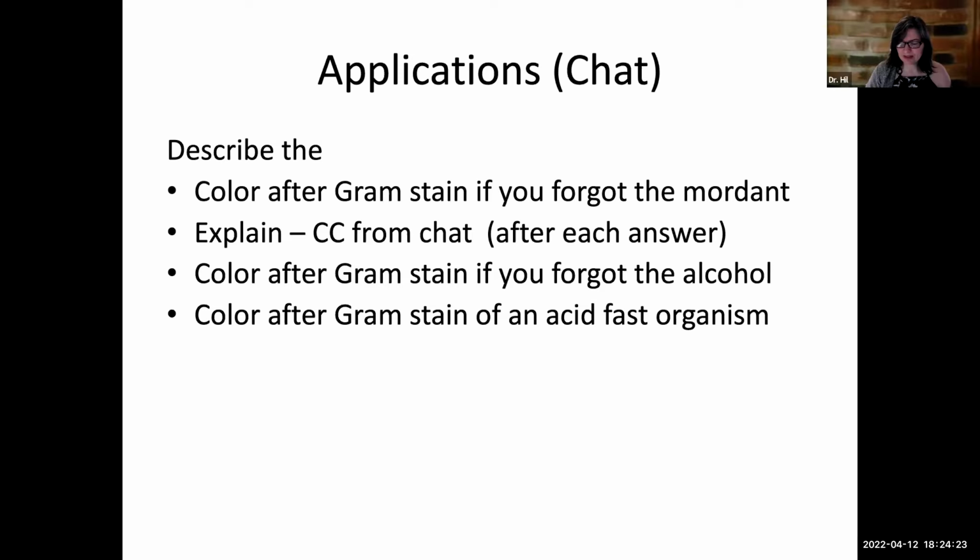Yep, that's exactly right. The whole reason that we have to do the acid fast test is that those organisms that happen to be positive for an acid fast stain are not going to be positive for anything else because they have that waxy coating, which resists normal dyes. And I would say resist in particular water soluble dyes. All the Gram reagents are water soluble.